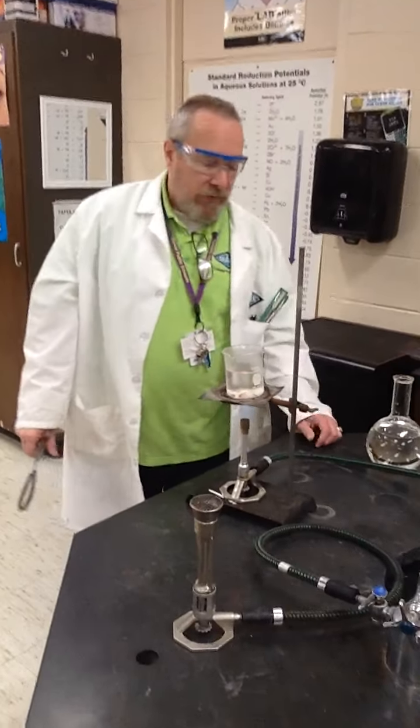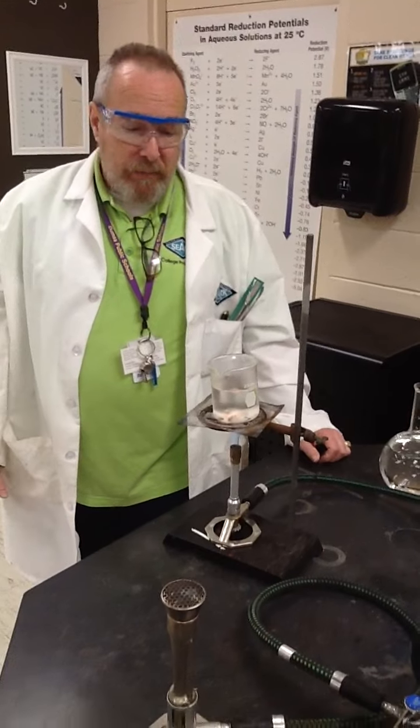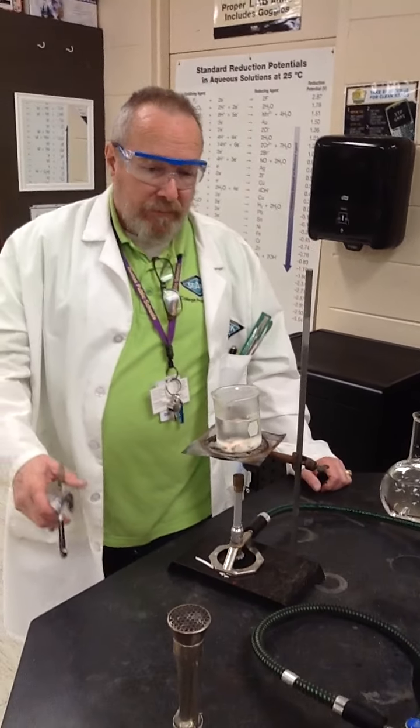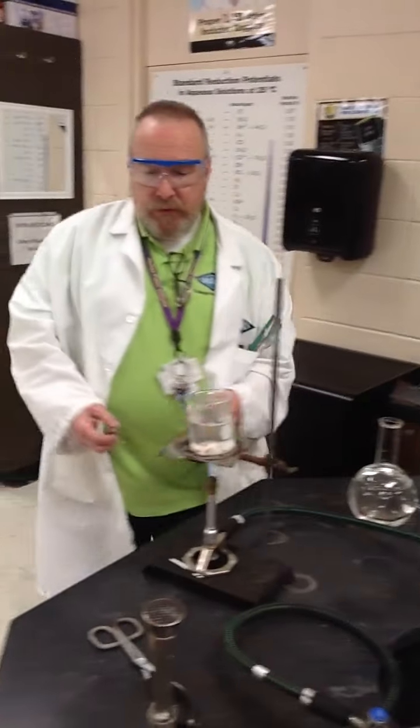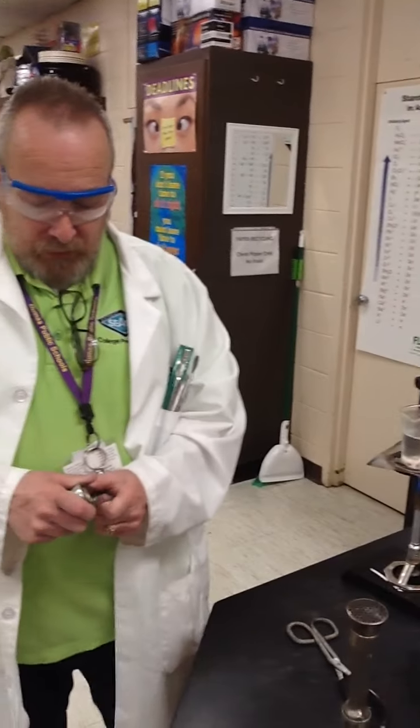And this is very hot. It will very quickly boil. While we're waiting for that to boil, let me tell you about the striker again. These strikers do wear out. The flints are being worn down every time you strike them.